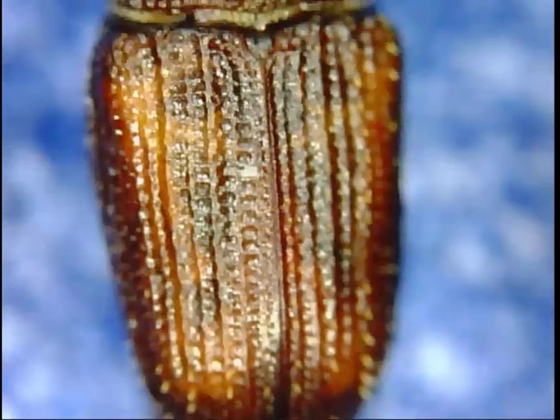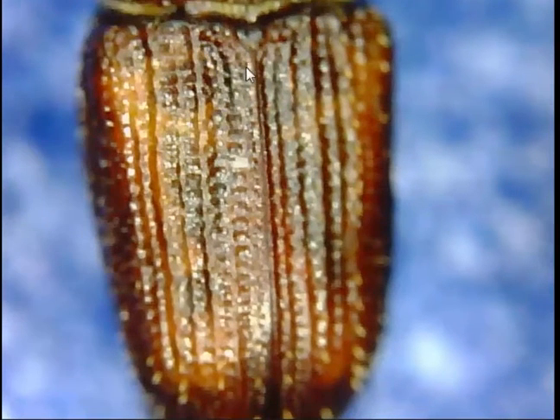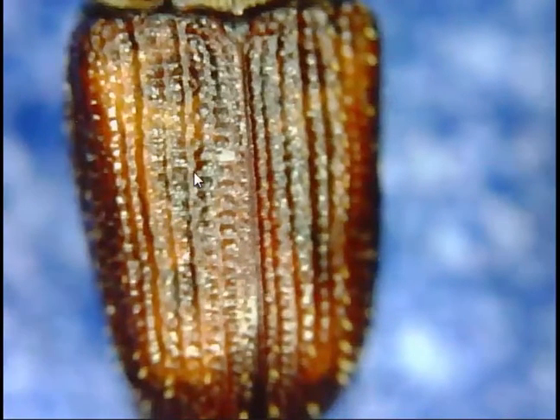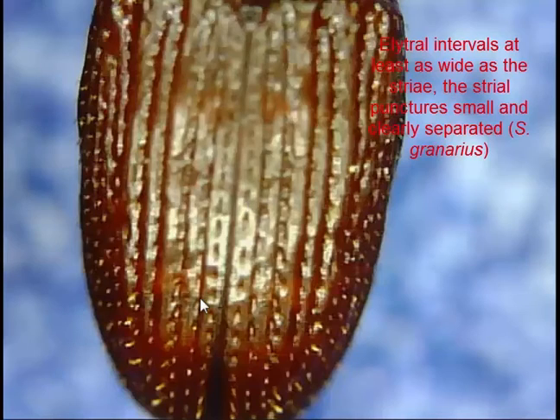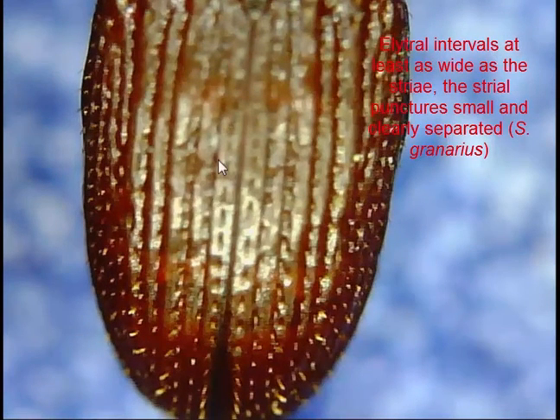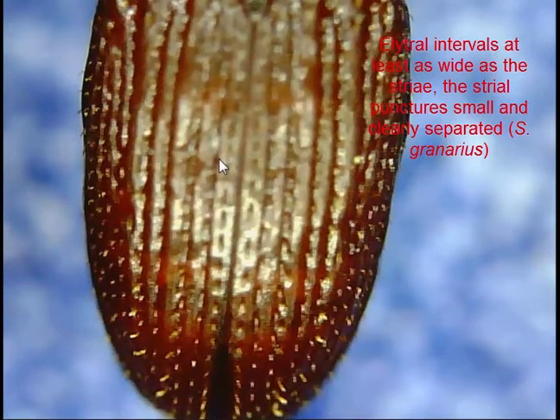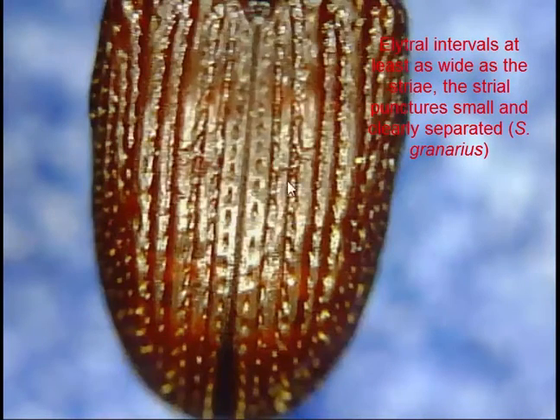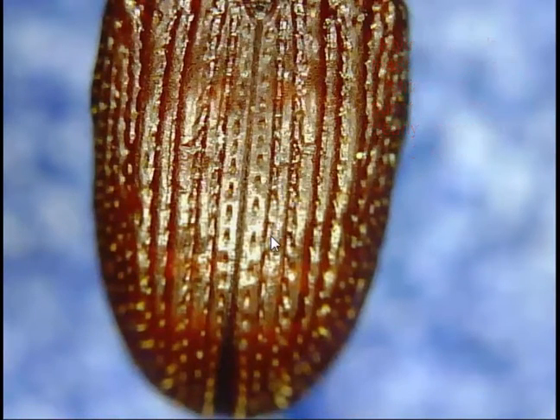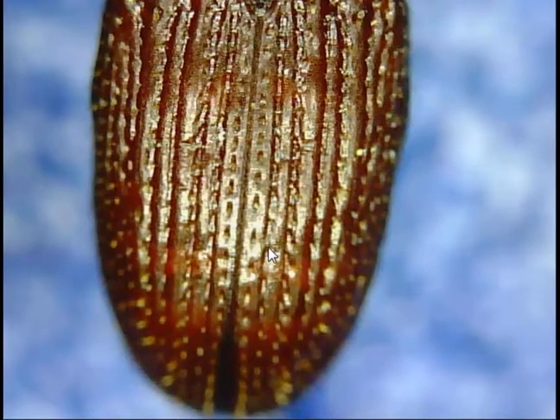Looking at the elytra, here's Zeamais — you can see narrow ridges running down the wing covers and also dimpled punctures in the elytra. Comparing this to Sitophilus granarius, the ridges have small punctures on them and the ridges and grooves are roughly equally spaced. This gives a much more even, shinier colour to Sitophilus granarius that you can pick up even under low power.